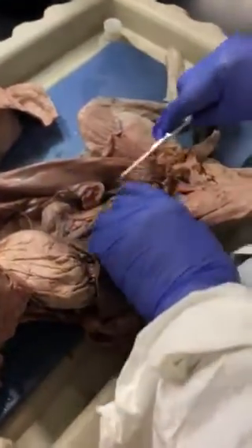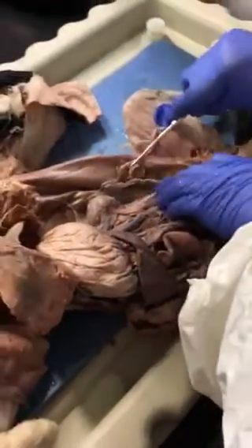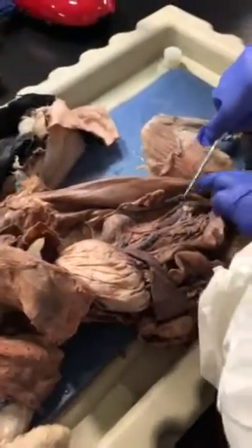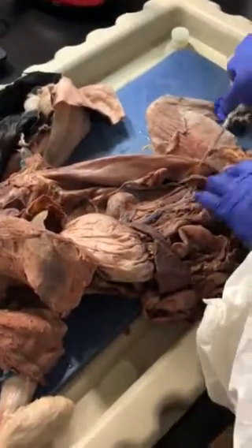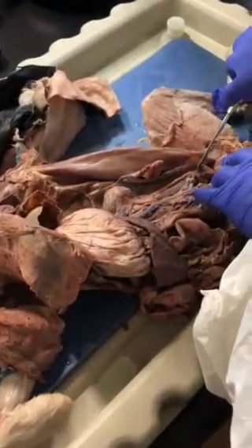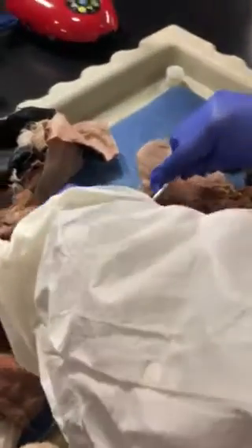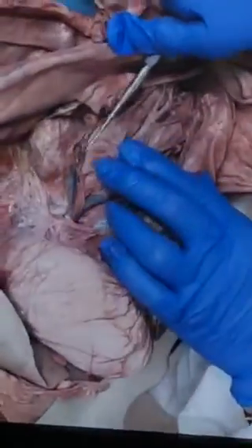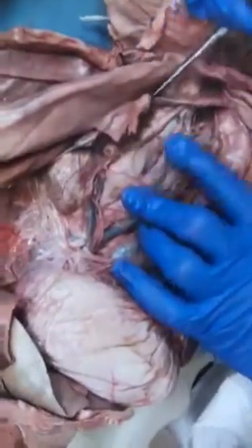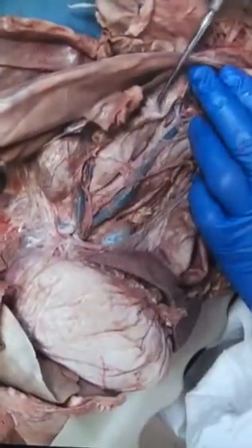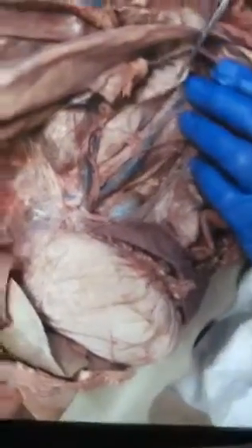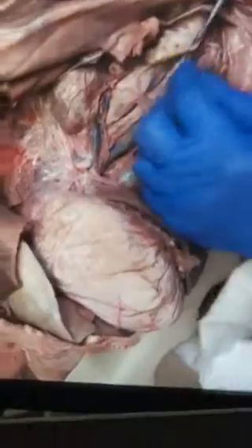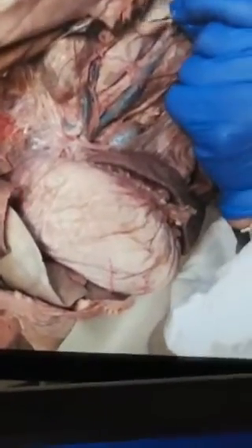And then, if this is the kidney, from the urinary bladder you have a tube that branches from it connecting to the kidney — that is the ureter. Do not confuse it with the uterus.